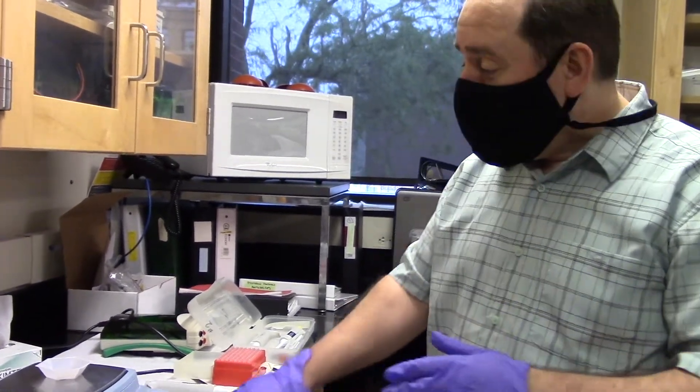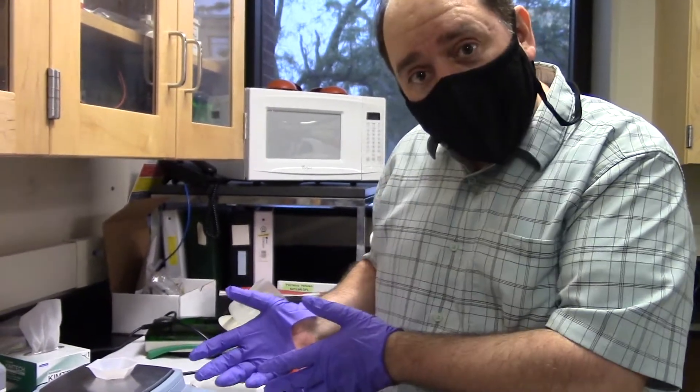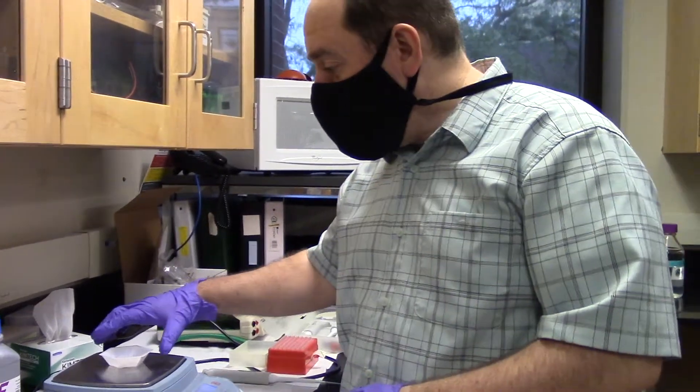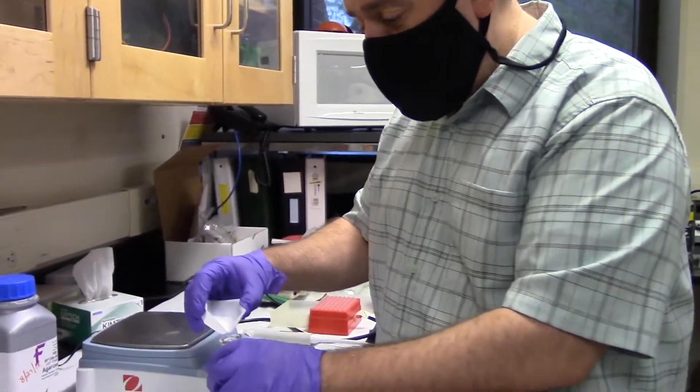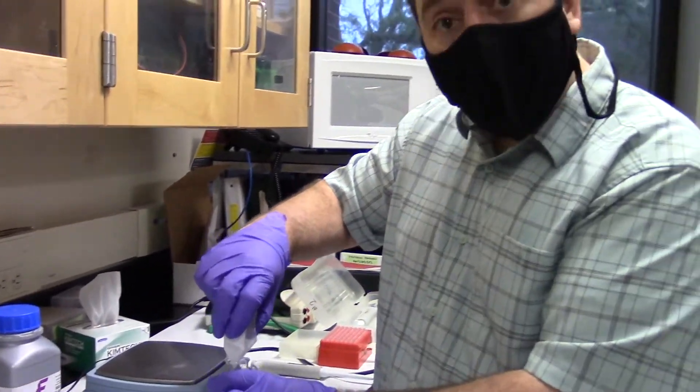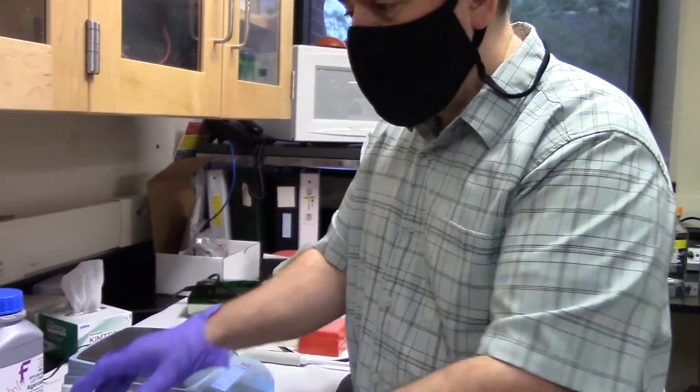The key is that the only thing I care about is that the DNA spreads out by size. The longer pieces of DNA will get caught on the matrix and move more slowly than the short pieces. Whether I added half this much agarose or twice this much, either way I would still form a matrix that would slow down the larger pieces of DNA more than the smaller pieces.